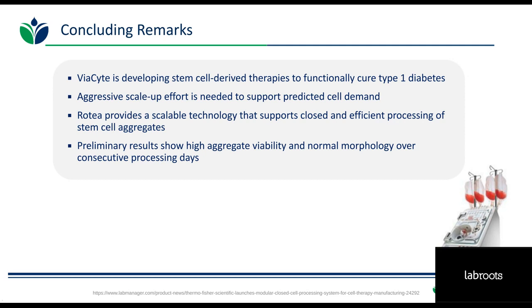Thank you. And our last question here, what is the approximate process time to go from 1,000 milliliters to 5 milliliters? Marianne again here. Depending on the chosen settings, again, you have the control. The volume reduction processing time for 1 liter down to 5 mils can be as fast as 20 minutes. Thank you. Great. Thank you again, Marianne.